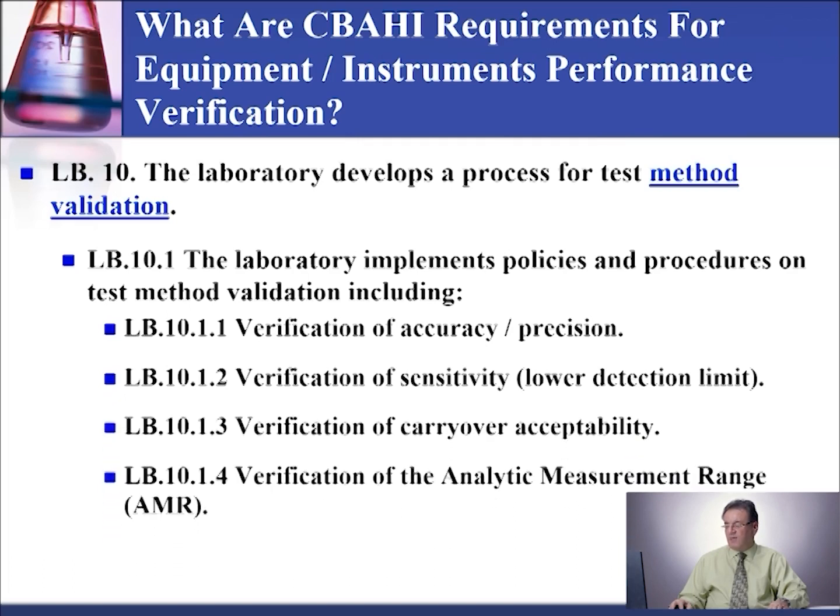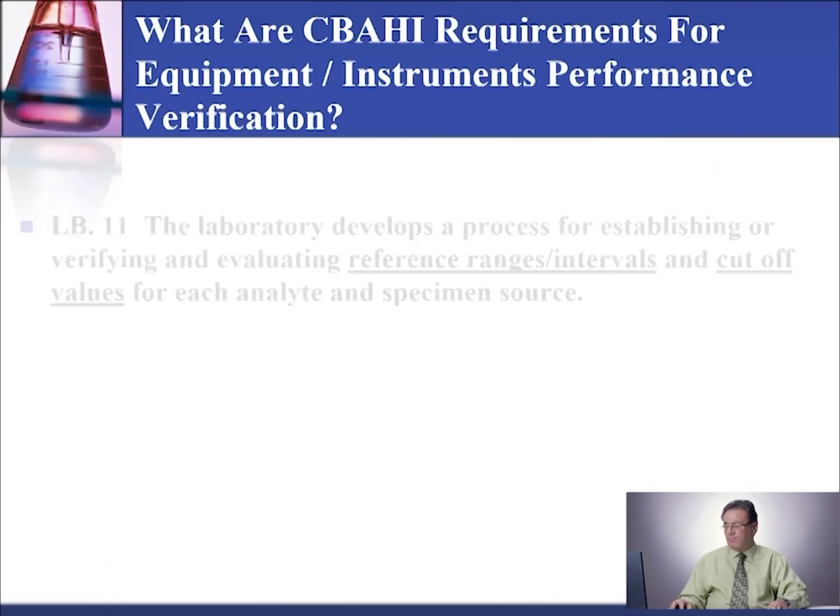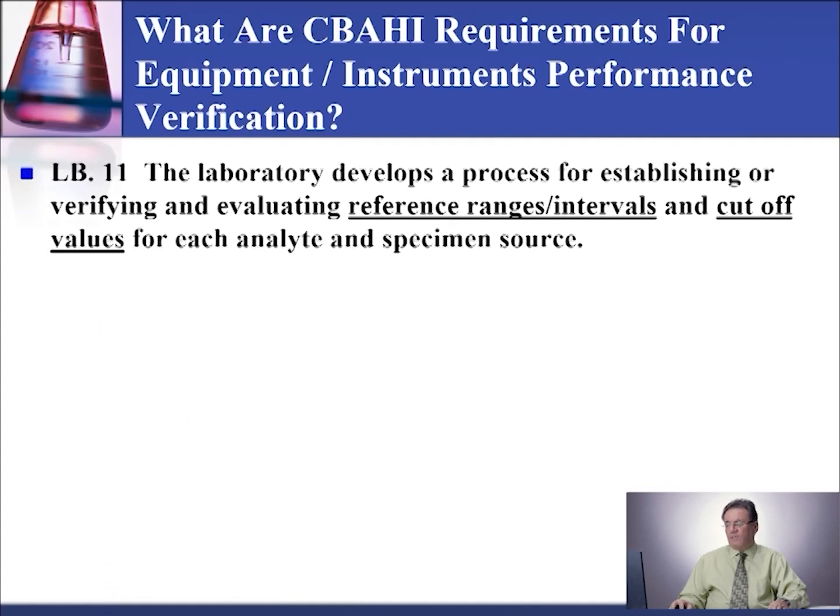Some notes regarding this stage. As applicable, training of operators for the new equipment or instrument should be provided or started during this stage, and recorded and maintained. The extent of OQ testing depends on the complexity of the equipment or instrument, and on its intended use.